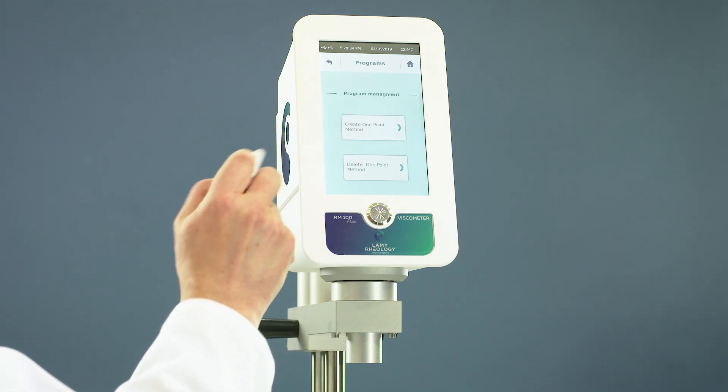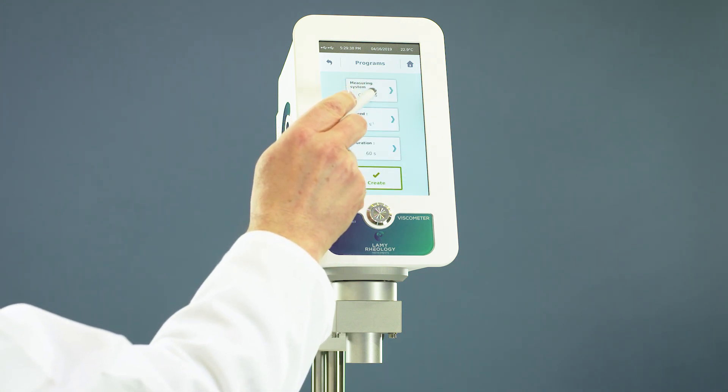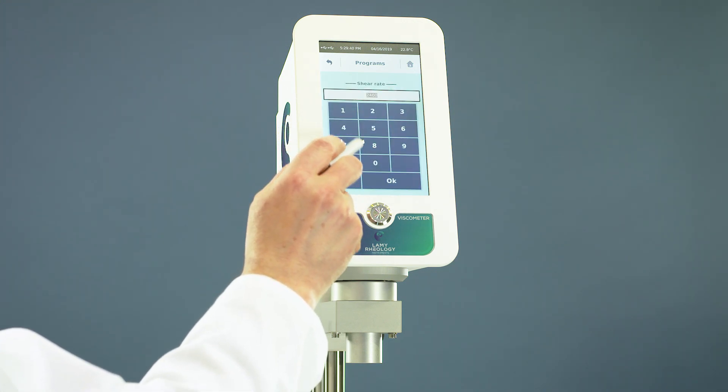Go to program, select the spindle, the shear rate, and the duration, then save your method.